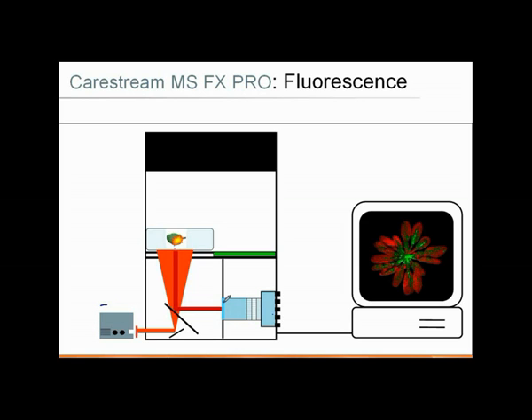This is very different from fluorescence microscopy, in that in fluorescence microscopy, all the rays of light are basically coming in to the filter in parallel, which means standard interference filters are just fine. However, in a system that uses a low f-stop lens, such as the f2.5 lens we have in this system, you're collecting rays from much wider angles.